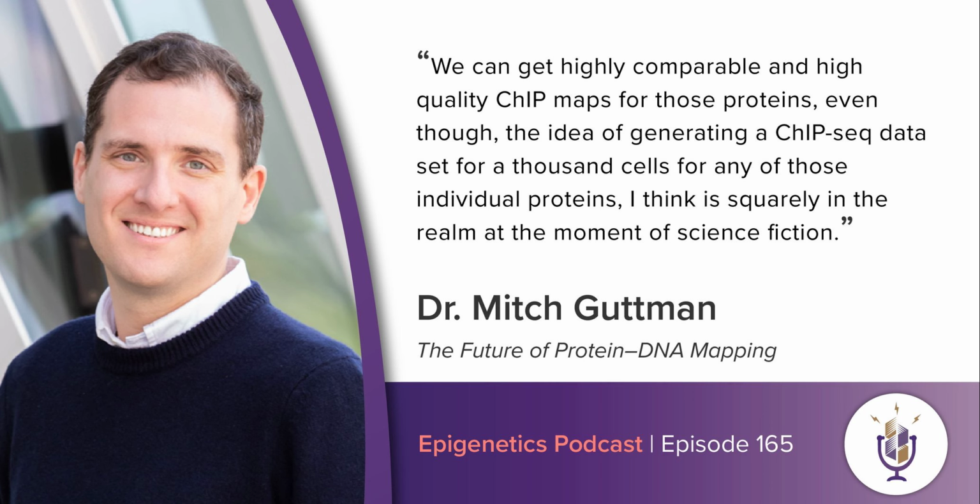And the reason why this is valuable is that if we can resolve the DNA that's bound to an individual bead, we can effectively treat each bead like an individual reaction. We can do an immunoprecipitation, bind proteins to their antibodies on individual beads, and then do a split-pool barcoding to add individual tags sequentially to the chromatin DNA, as well as to the oligo that is on the bead.